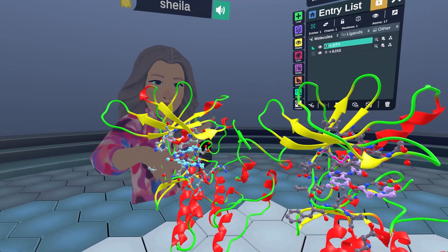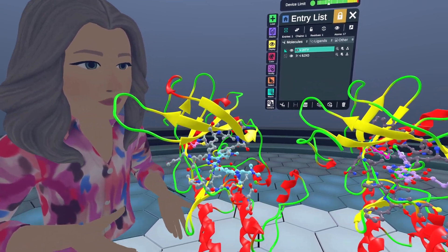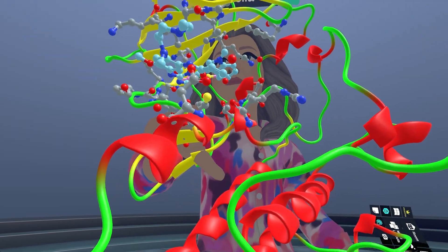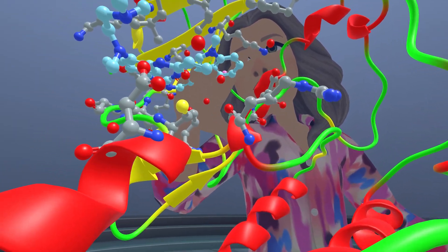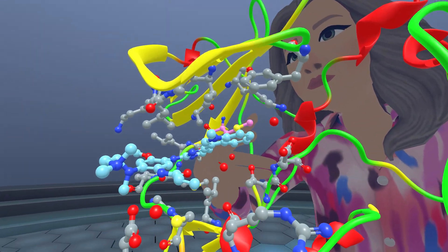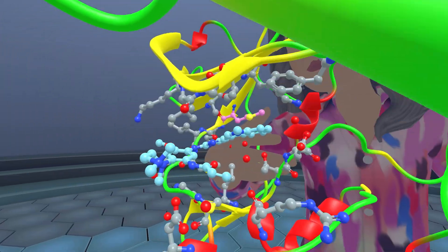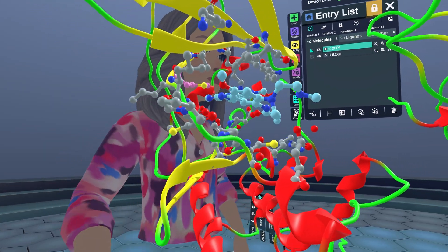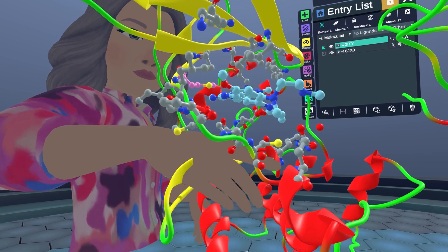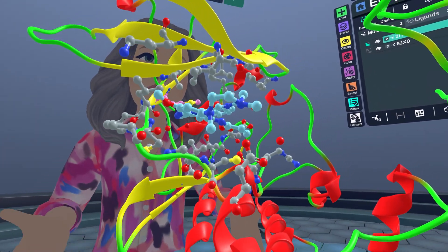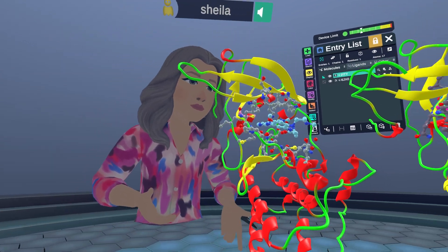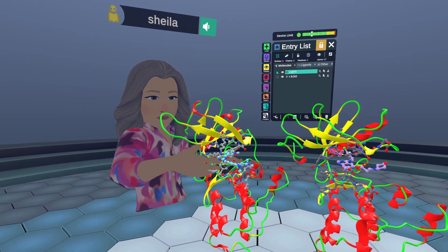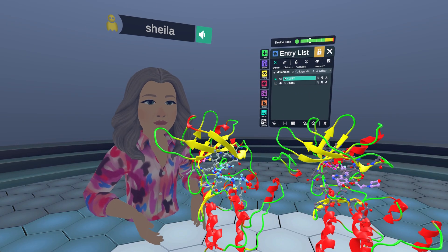The strategy this group used was to employ irreversible binding of a cysteine with the acrylamide of this inhibitor to really drive potency. In exchange, they gave up some binding in the back pocket near the methionine that won't fit if they go deeper in the pocket, and they compensated for that with higher binding affinity. If we wanted to reverse engineer this, I'm going to show you how we can quickly find a cysteine in an active site or any region of the protein.